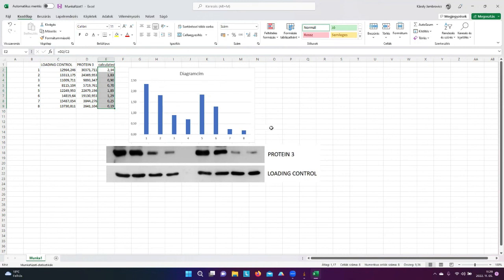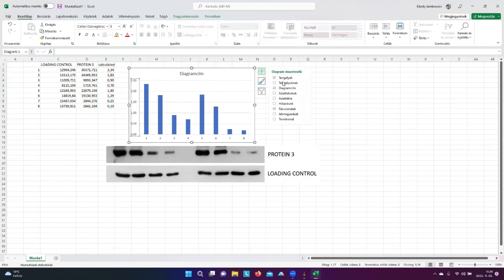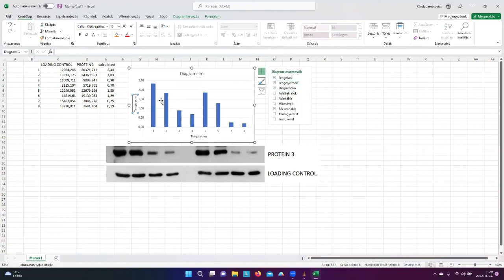Because what you did is a densitometric analysis, but here you were using optical density. And because you will do an integration, the one that you need to type on the axis should be the so-called integrated optical density.